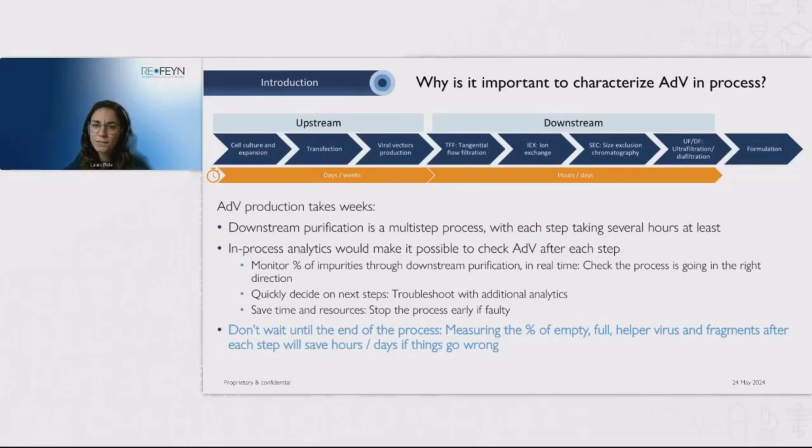So you can understand whether things are going in the right direction, and you can take a fast decision on the next steps, whether you want to troubleshoot with additional analytics or stop the process if things are not going right, saving time and resources. This means that you don't wait until the end of the process to actually get an answer on what's going on during the manufacturing. And you could save potentially hours or days if things go wrong.